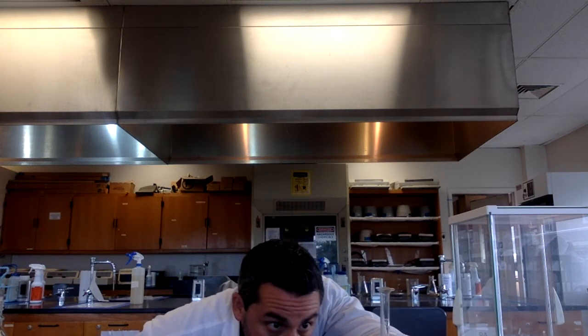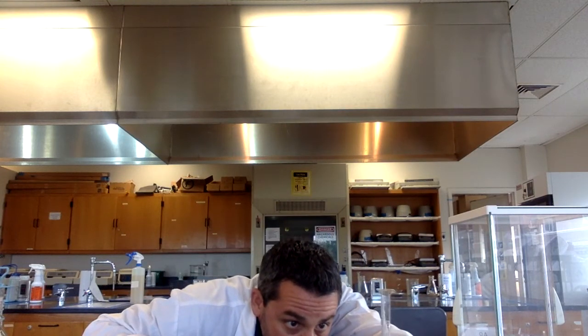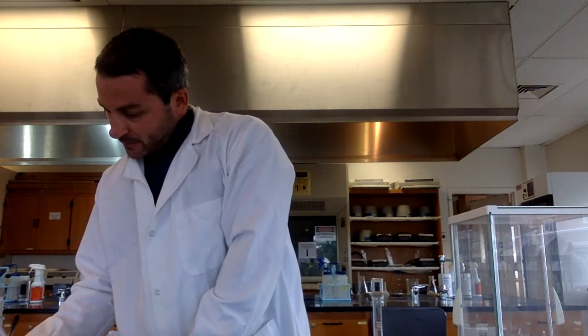Again, I'm going to read the bottom of the meniscus at eye level. This graduated cylinder has marks that represent the decimal places, so it goes from 1 to 10, and each line in there is a decimal place. So now I can estimate to 2 decimal places. I've got 5.1, and then it's in between the 1 and the 2. So let's say 5.15. That's the volume of my liquid.